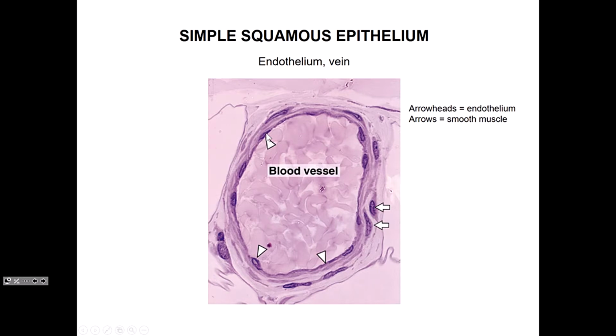And then when we look at the structure of blood vessels in the cardiovascular lecture, we also look at electron micrographs, so you get very familiar with the arrangement of blood vessels. The endothelial lining of blood vessels, it's always just one layer. You see this as a blood vessel. The endothelial cell lining is always one layer of cells, so it's got to be simple, right? And they're always elongated, so it's squamous.